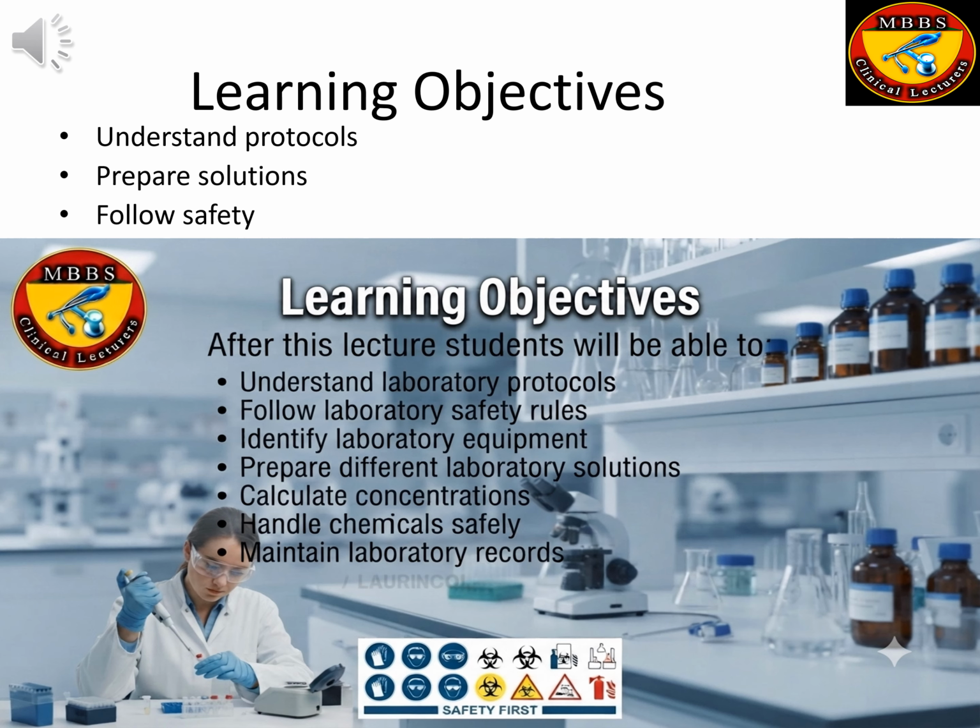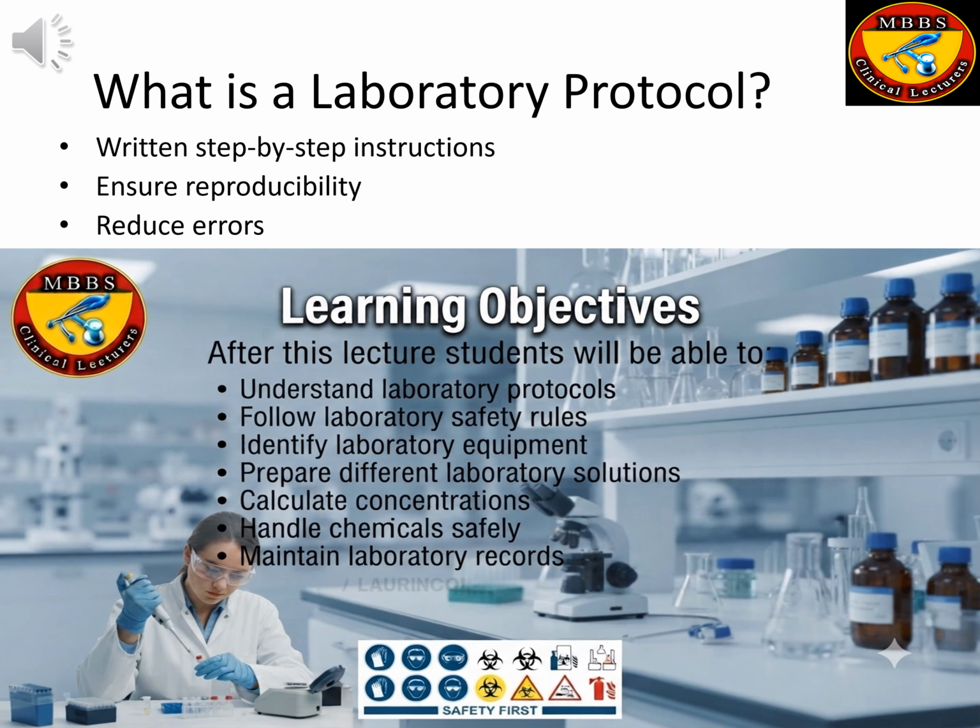Learning outcomes. Explain laboratory protocols. Prepare different laboratory solutions. Calculate concentrations. Perform dilution calculations. Follow laboratory safety rules. Maintain accurate laboratory records. What is a laboratory protocol?